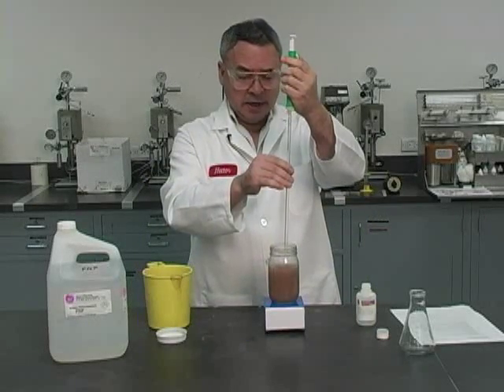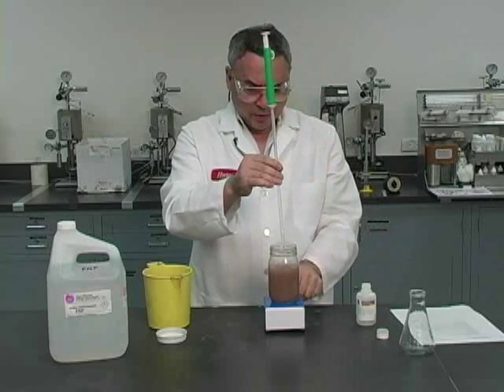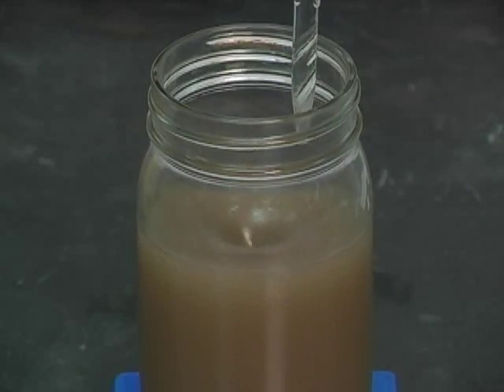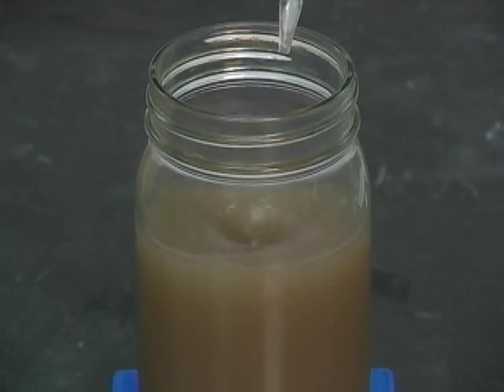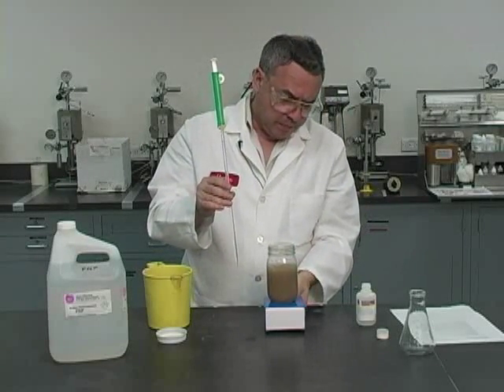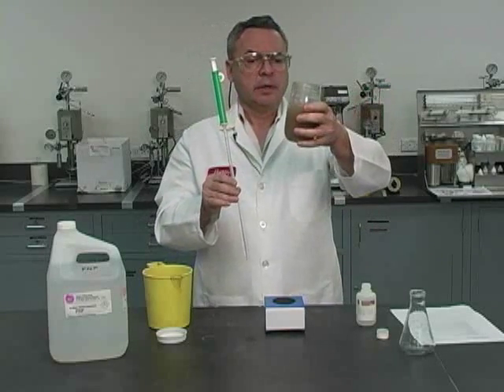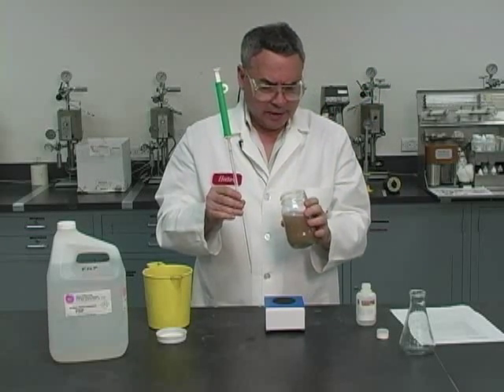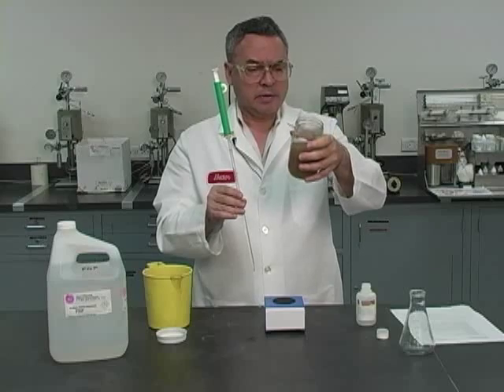Sometimes, in order for me to verify that, I might have to stop the rotation, the stirring here. Now we got a pure brown. I'm going to make sure that it stays this way. That means we have neutralized this emulsion. Looks to me like this is pretty much pure brown with no trace of pink. I'm going to have to wait approximately a minute and see if I see any tones of the pink color coming back as a consequence of the protons being absorbed by some alkaline elements that are still in solution.